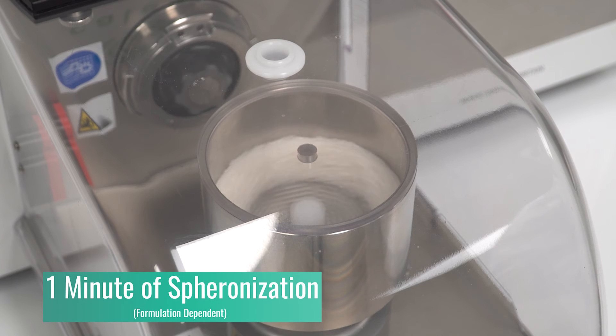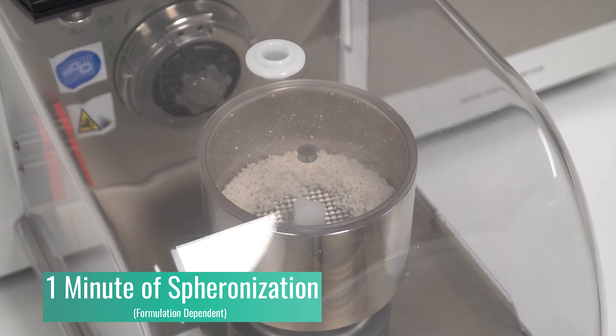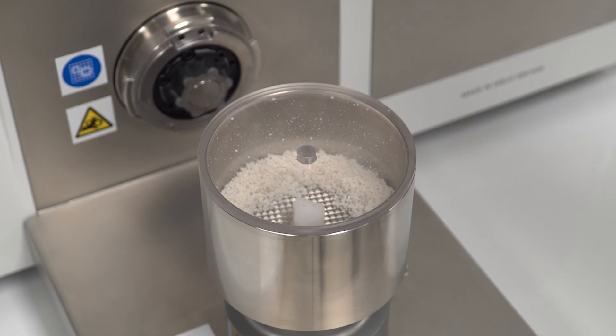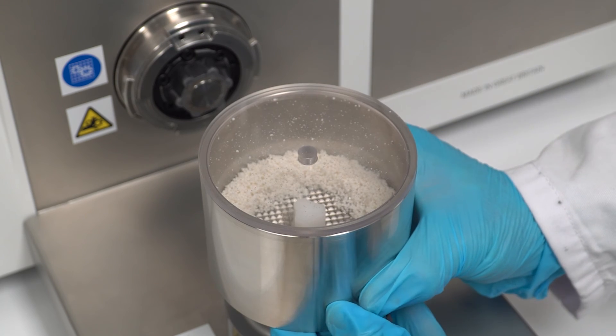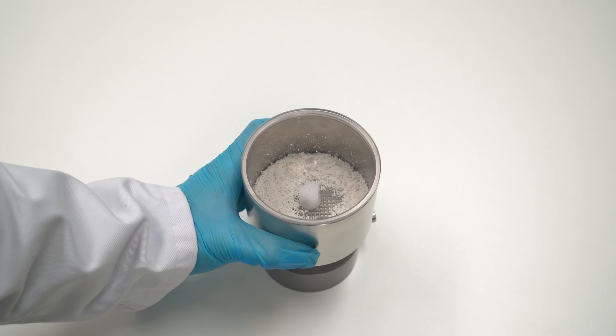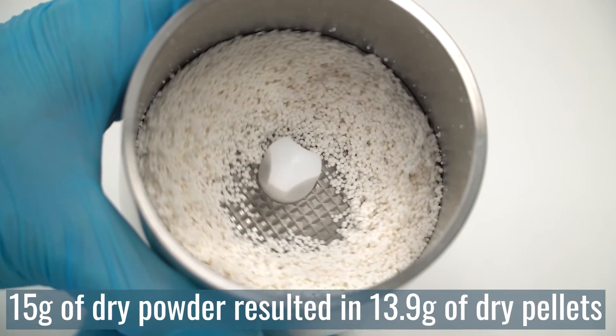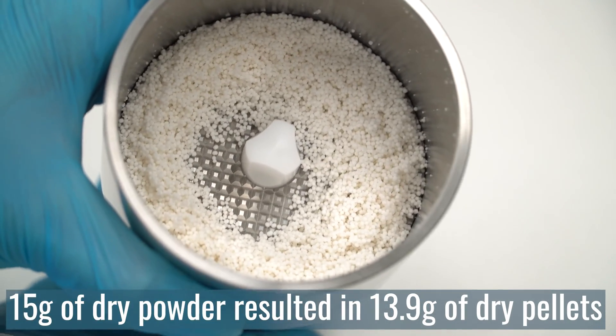After only one minute of spheronisation, our batch is complete. Different formulations may require a longer residency time. We can now remove the safety cover and inspect the result. Starting with 15 grams of dry powder, 13.9 grams of high-quality pellets were made in under 20 minutes.